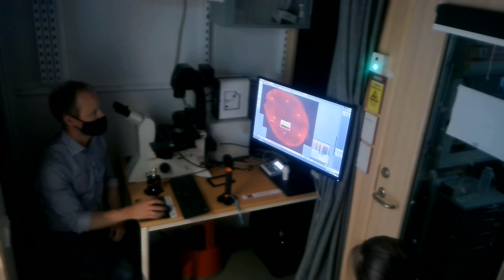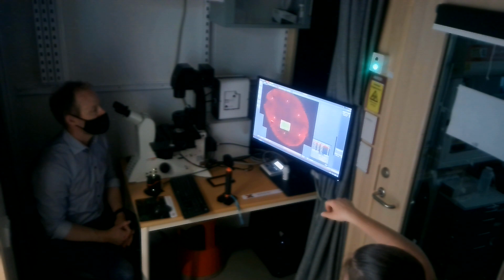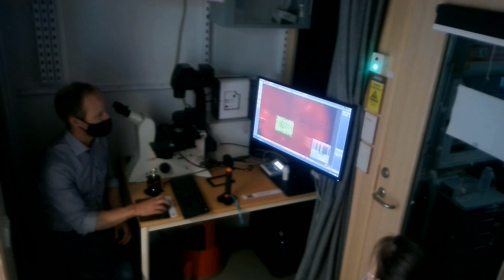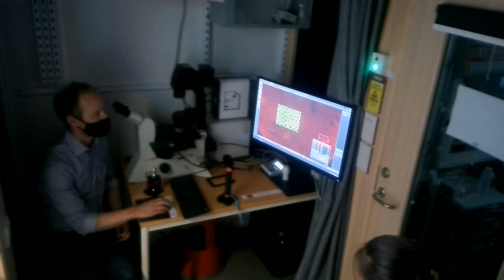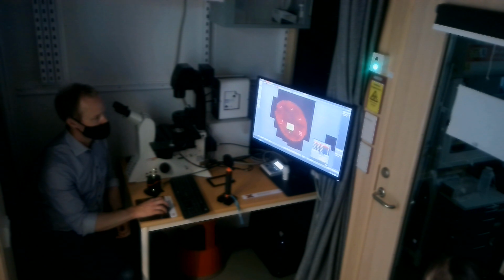And now it applies the focus map which we captured, although it's outside of our region. Exactly. So it will interpolate between all of these focus points so that it should be applied also in here. At this time we haven't used the mark, but we use the find all by autofocus. So in this case it found all these points using the autofocus.